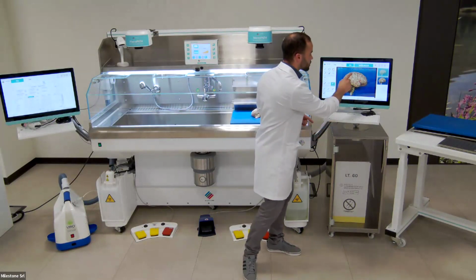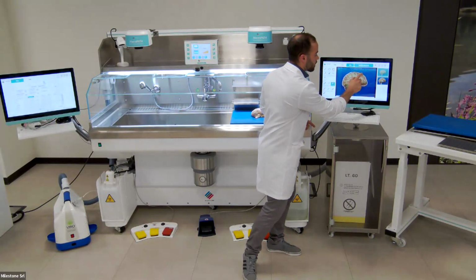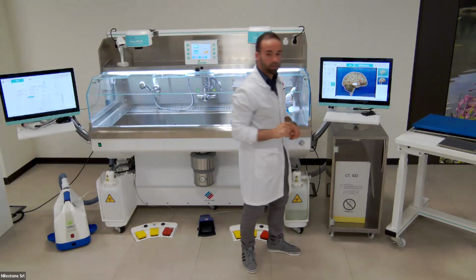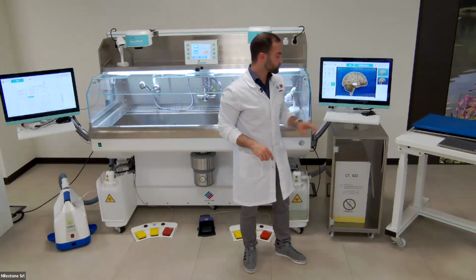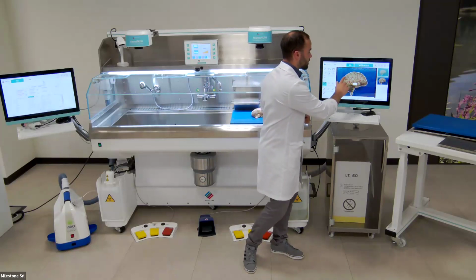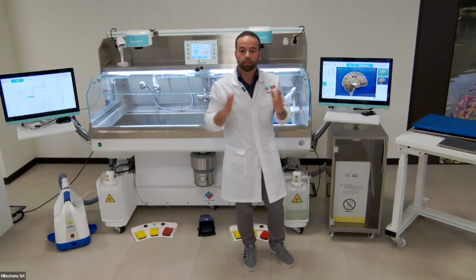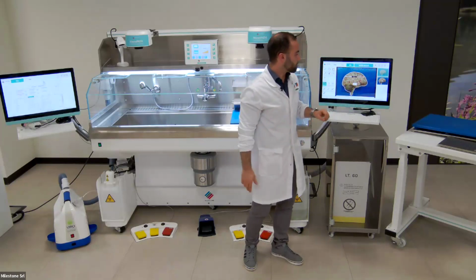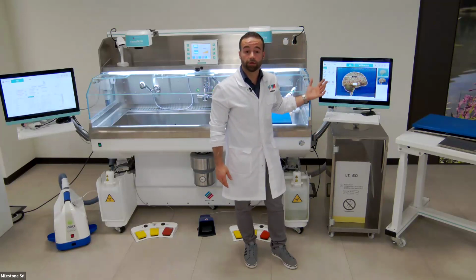I choose the correct tool, and then I just draw on the screen, and I have the area in square millimeters. Then we also have the possibility to perform sizing directly on the screen, and a lot of other editing tools.